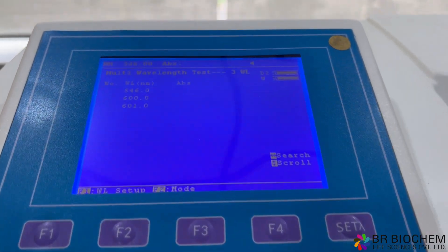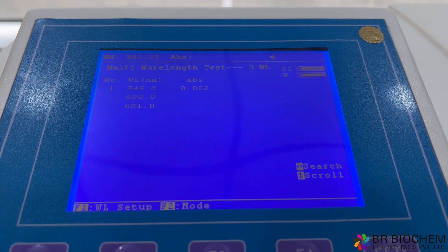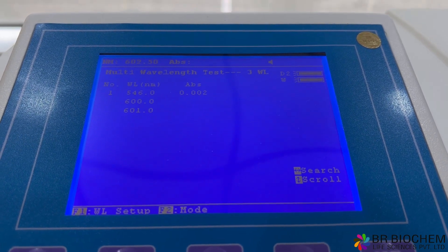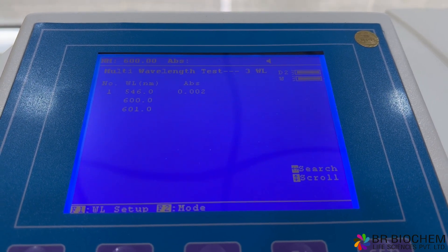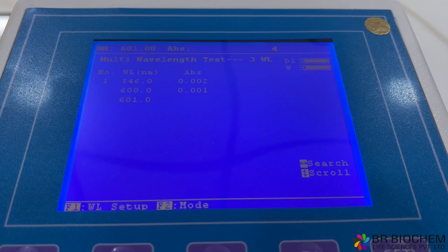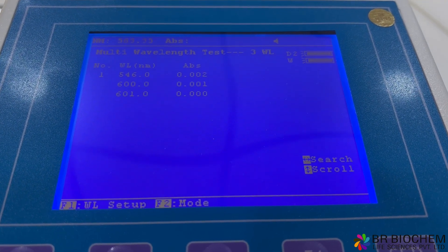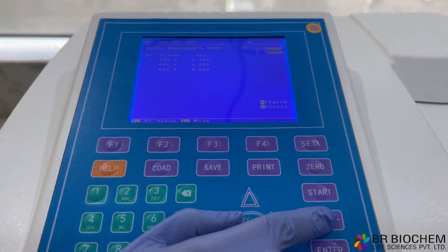With its impressive technical specifications, convenient features, and versatile functions, our double-beam UV-VIS spectrophotometer is an indispensable tool for educational institutions, research laboratories, and quality control facilities. Experience the precision and reliability of our spectrophotometer and unlock a world of possibilities in spectroscopic analysis.